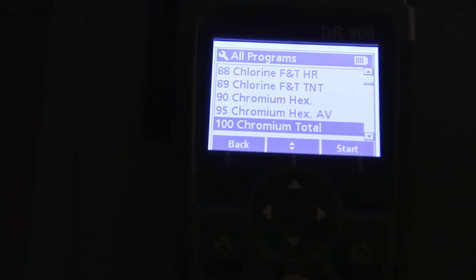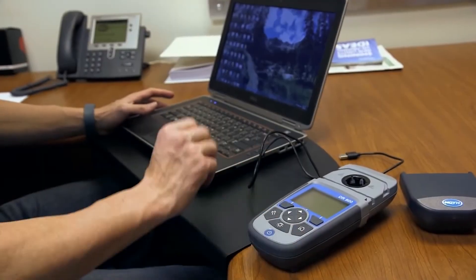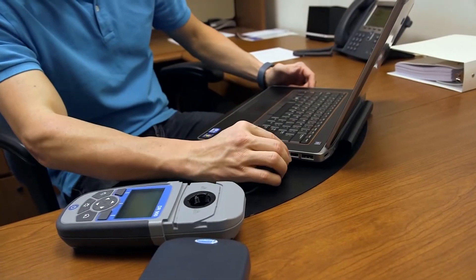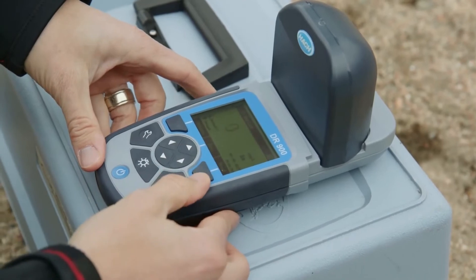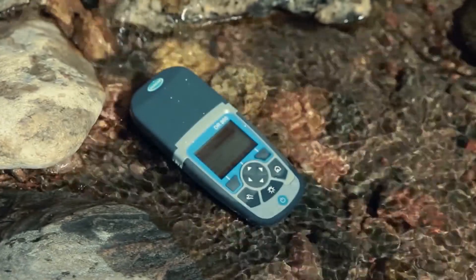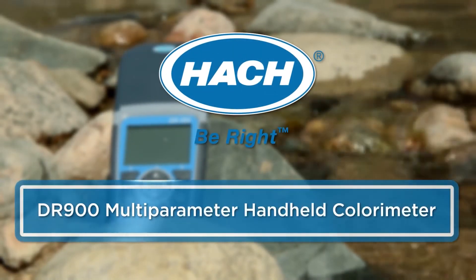Use the backlit display at the push of a button for use in low light areas and high glare conditions. You can store data for up to 500 tests and use the USB port for simple downloading or transferring of information. You maintain absolute confidence in your results reporting.